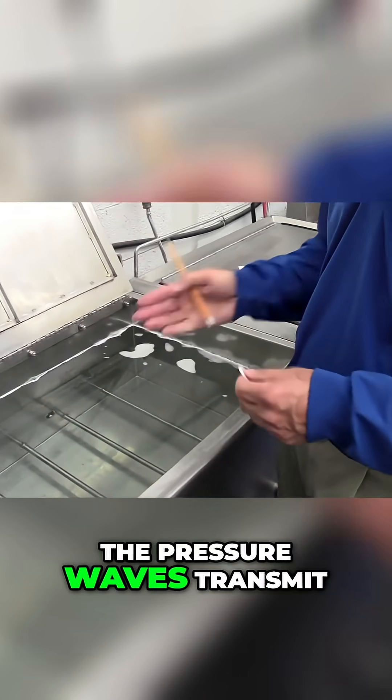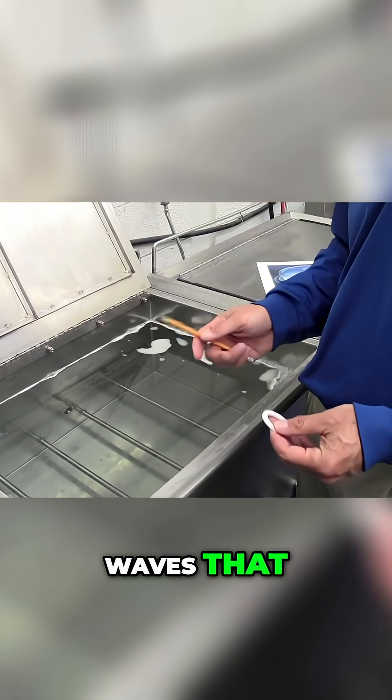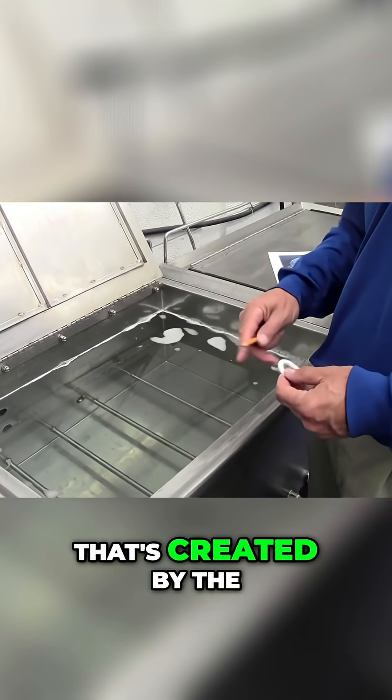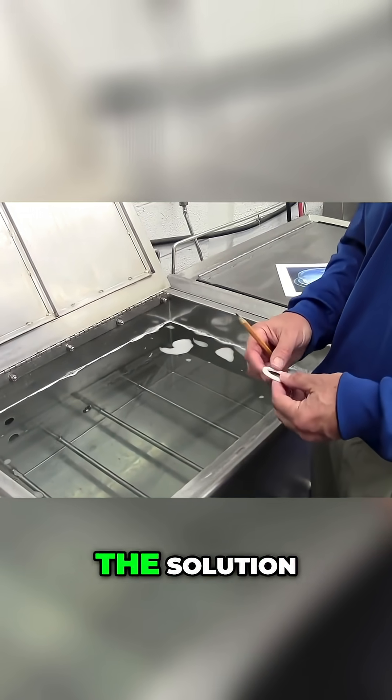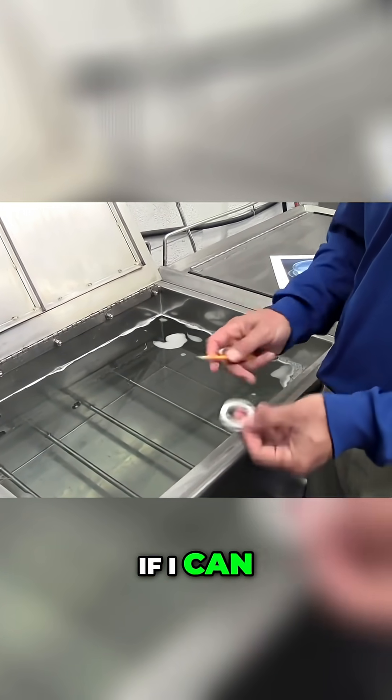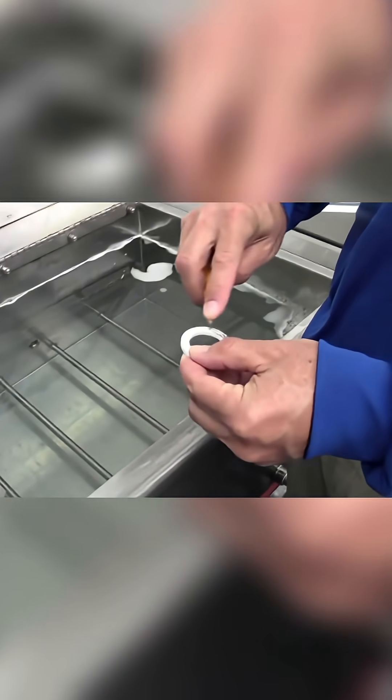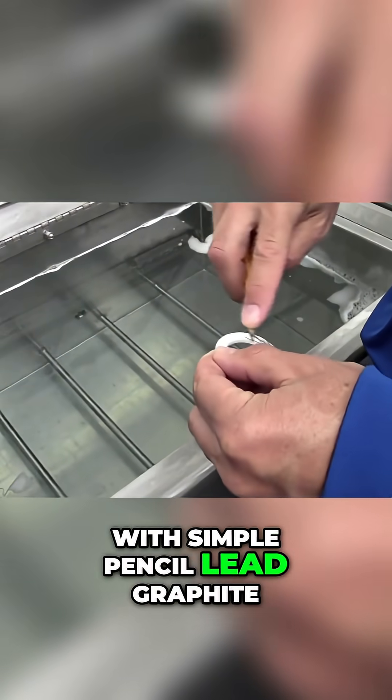So we showed how the pressure waves transmit through the solution, but again, it's not the pressure waves that actually do the cleaning. It's the cavitation process that's created by the alternating pressure waves in the solution. I can show the cavitation if I coat this ceramic ring with simple pencil lead graphite.